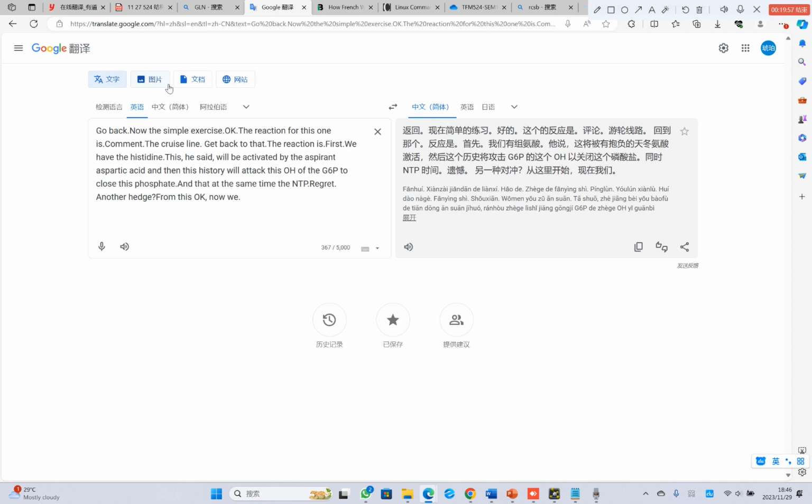Okay, two things. I want you to find this ring, the histidine ring. Another one is the ring of this NADP. Find these two. You can find them, no extra points, but if you cannot find them, minus 2. Press 2 again. Minus 1. Okay.